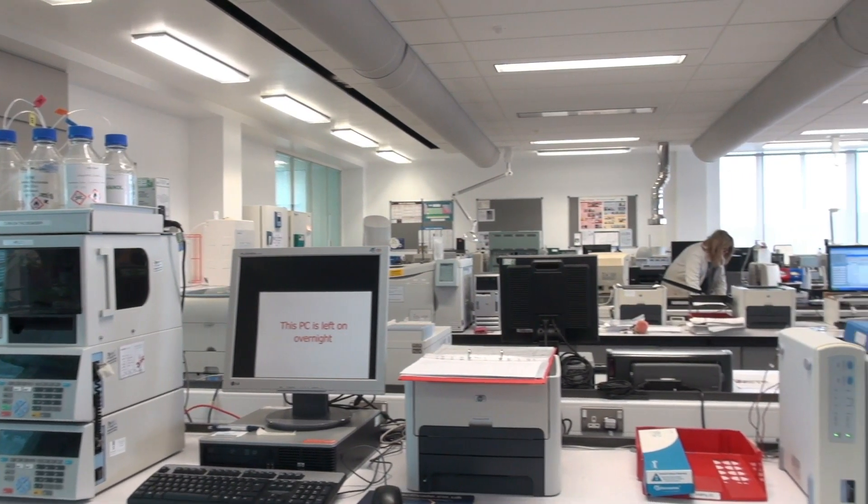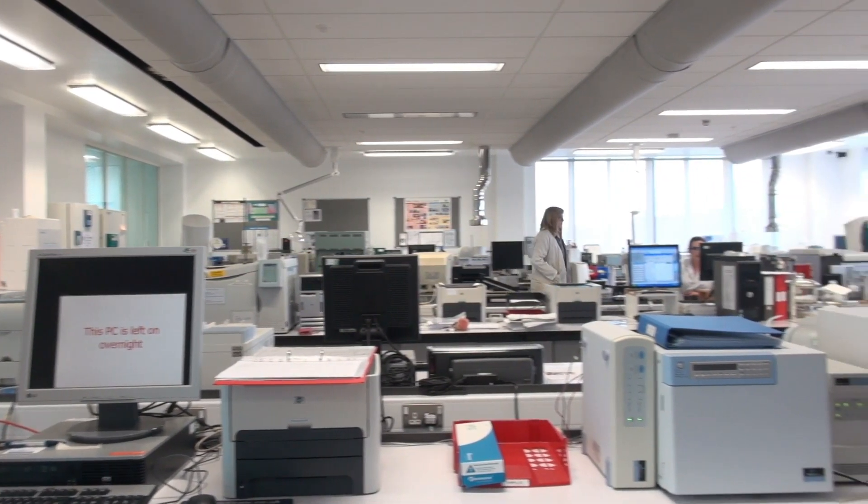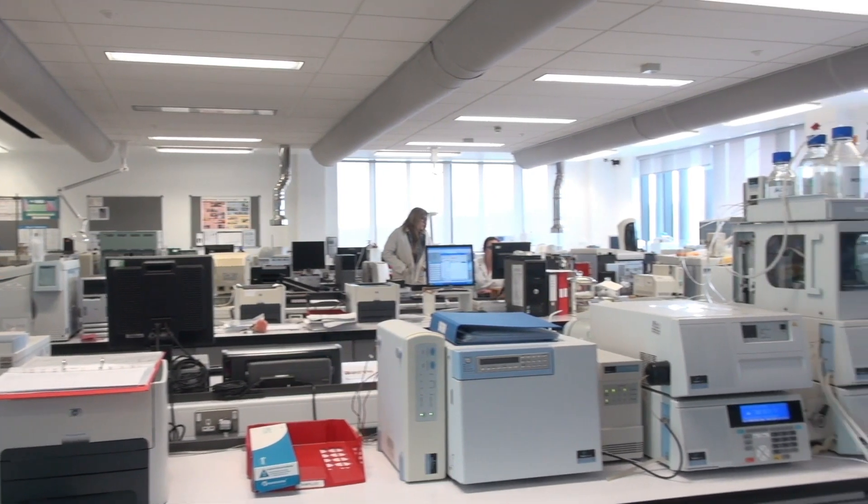Polarography uses a mercury drop, but we've got all the basics from infrared spectroscopy through to gas and liquid chromatography and a whole load of others besides. Right from the first year we get students in here analysing samples.